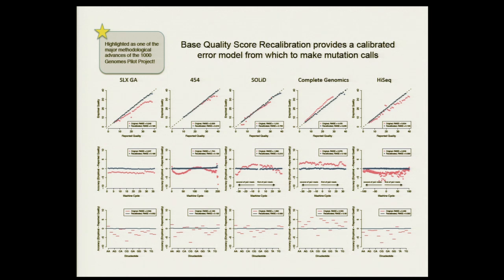The binding strengths are different, and then the base before that would be positive, right? Right. So it depends on what the sequencing machine is doing, right? Yeah. So if the machine would get confused by that, then you would see the bias. Otherwise, you wouldn't, right? Yeah. So this is a property of the sequencing itself.